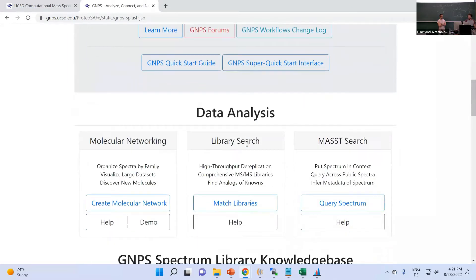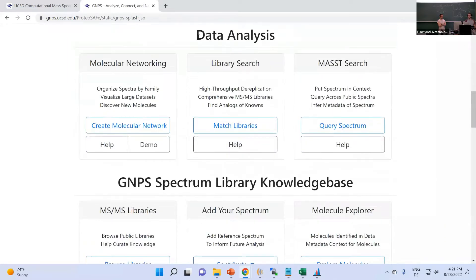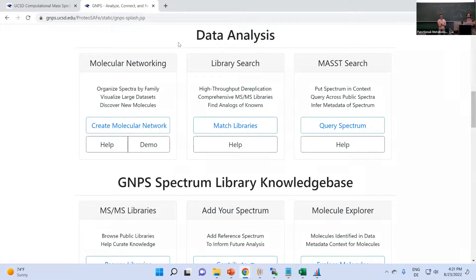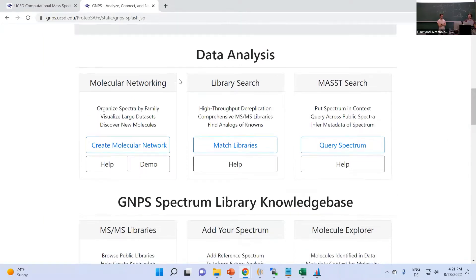If we scroll down further there are different data analysis workflows. For this workshop we focus on feature-based molecular networking. We did MZmine feature finding, we exported the feature table and one spectrum of MS/MS fragmentation information for each feature, and this information we want to upload to GNPS now.